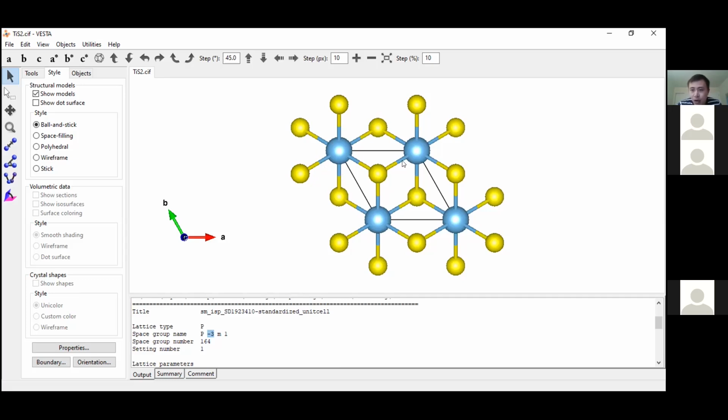So you can already tell something about the information, right? And that definitely agrees with the space group notation. The first notation is about the C-axis, which is the main axis of all the trigonal or hexagonal, also tetragonal groups, right? The main axis is always defined as the first symmetry direction. So that's why it's a 3 bar. And this M stands for the mirror.